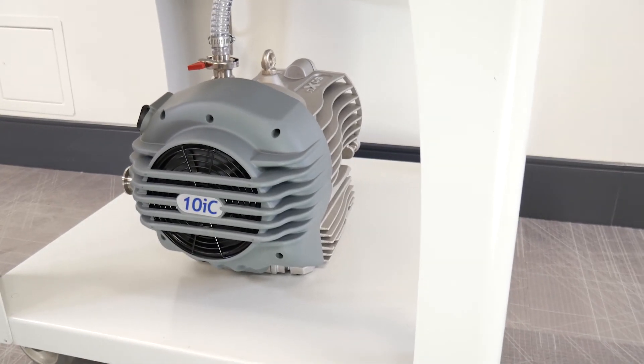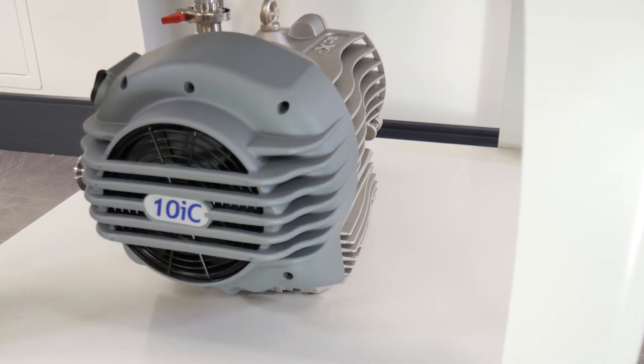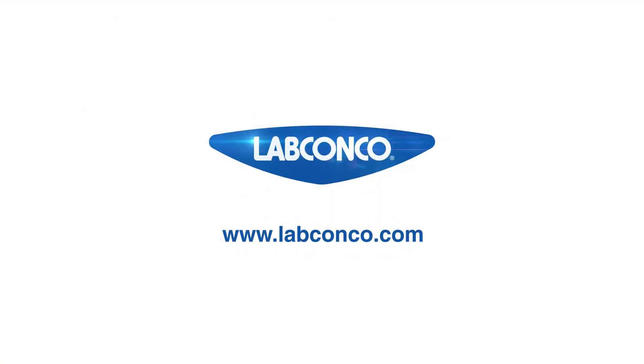Now your scroll pump is ready to use. Be sure to refer to your instruction manual for complete installation instructions. You can visit labconco.com to find out more.